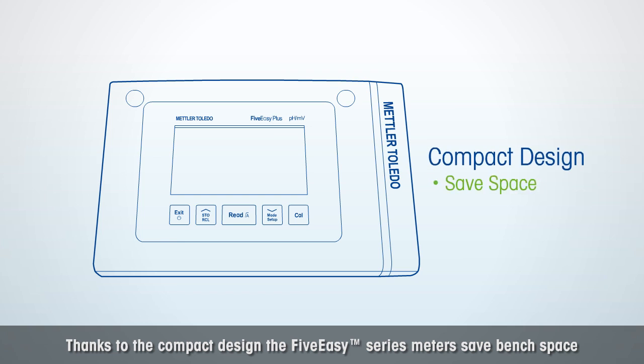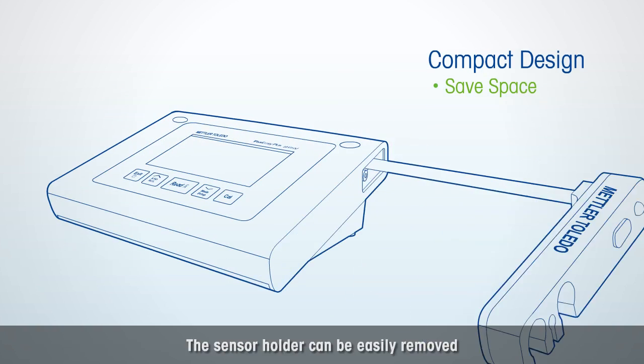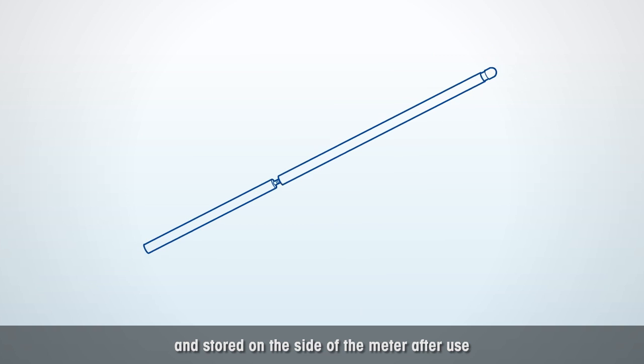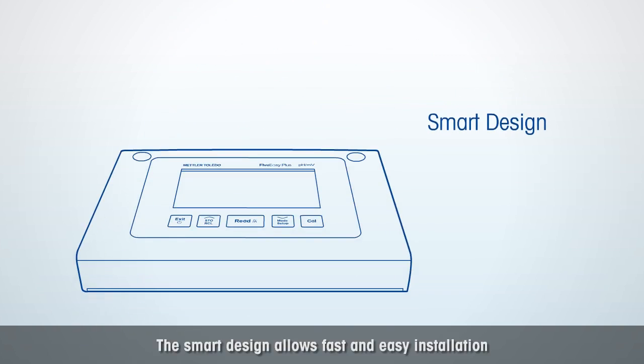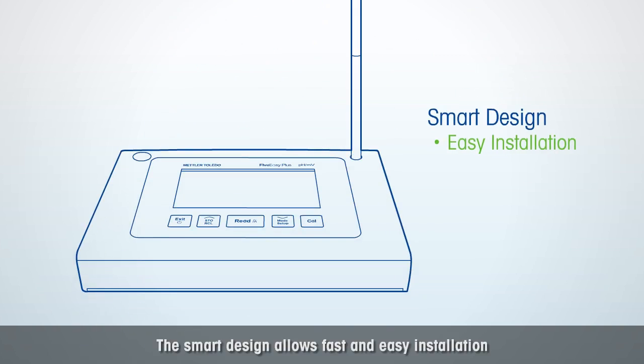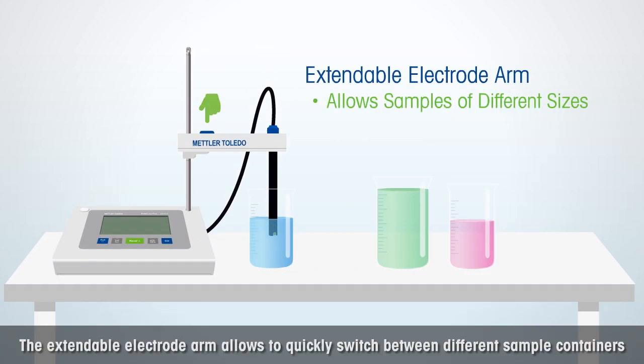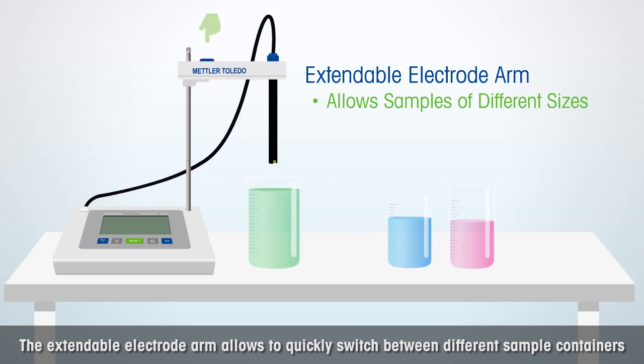Thanks to the compact design, the FiveEasy Series Meters saves bench space. The sensor holder can be easily removed and stored on the side of the meter after use. The smart design allows fast and easy installation. The extendable electrode arm allows you to quickly switch between different sample containers.